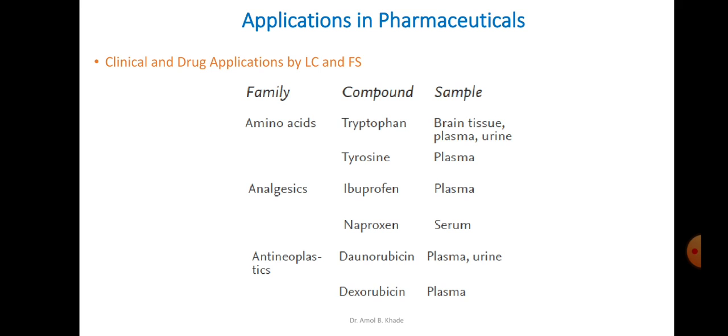So in this case, separation with the help of chromatography, and then the separated fractions are subjected to fluorescence spectroscopy for better accuracy. That is possible, and in many clinical areas we find fluorescence spectroscopy is often combined with liquid chromatography. Then we can extend it to a number of categories of drugs like analgesic, antineoplastic, anticonvulsant and so on. I have listed here only three of them.